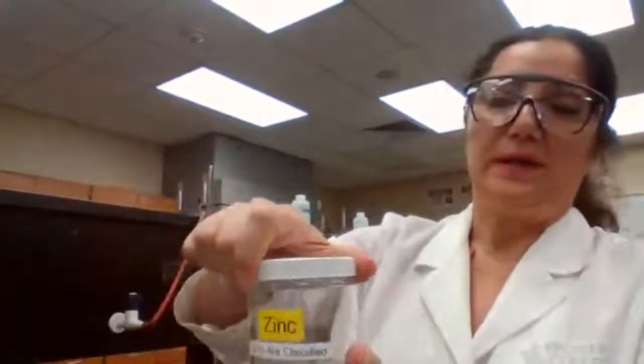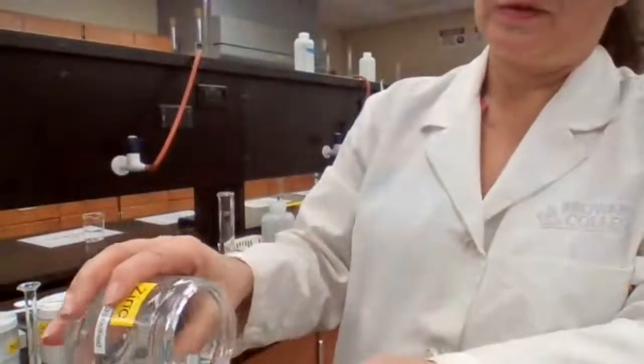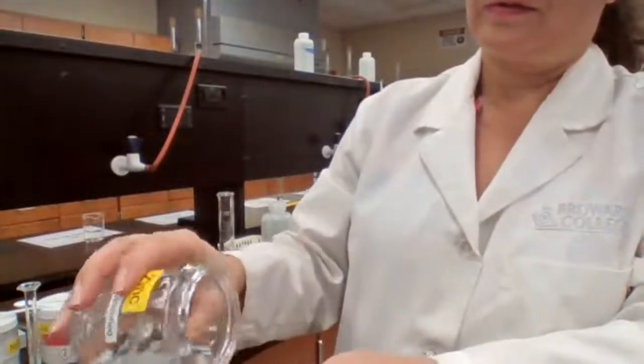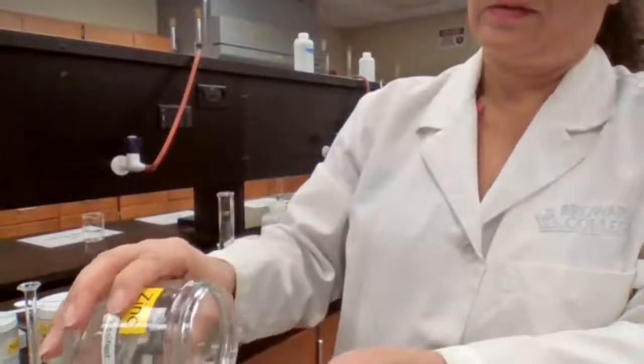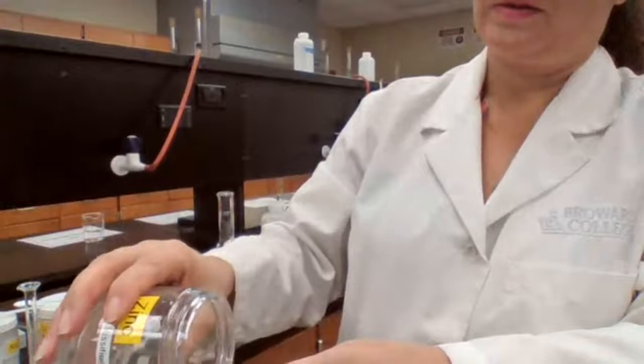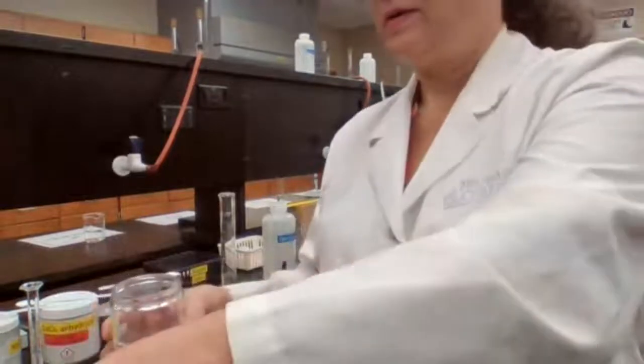Here's the zinc metal. In order to measure the volume for zinc metal, see, it's an irregular shape. Any irregular shape solid, you cannot find the dimensions and use a formula just like you did in math to find the volume. So because it's an irregular shape, what we are going to do is count first 20 pieces of this. 2, 5, 9, 10, 11, 14, 16, and 20. I have 20 pieces.